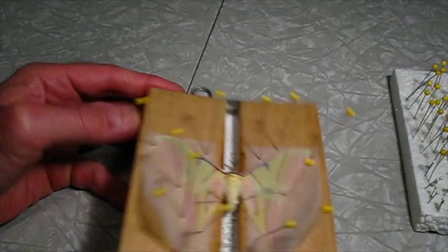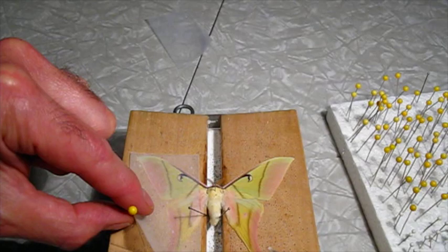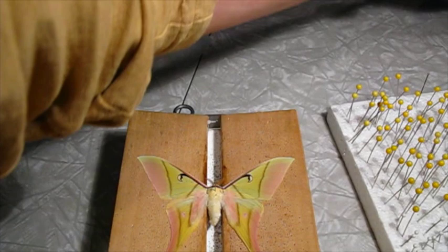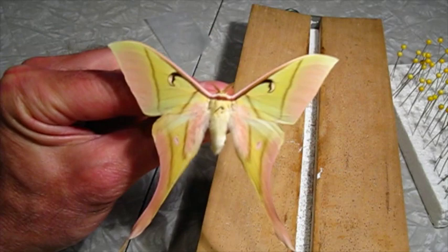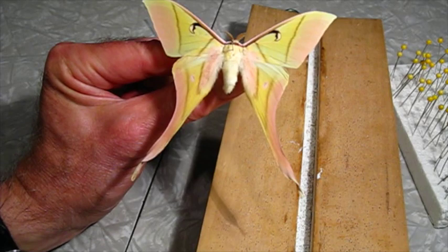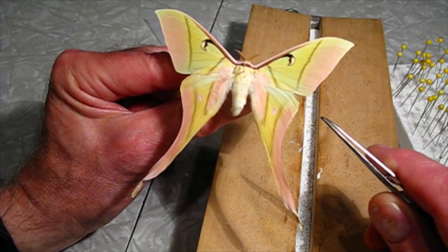It's been a couple of days and I believe these are dry. I'm going to pull the pins off and see how it looks. Let's hope it's all straight. I'm happy with that. There's a little bit of wrinkling right here, but I think that's just the way the moth came out.